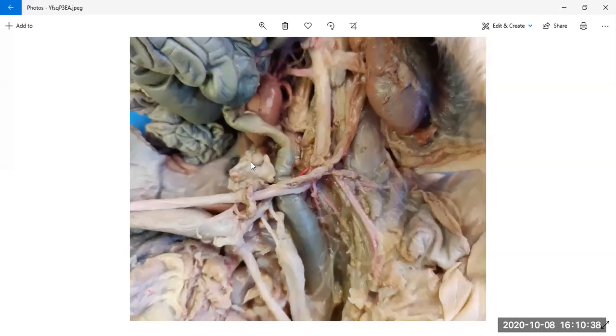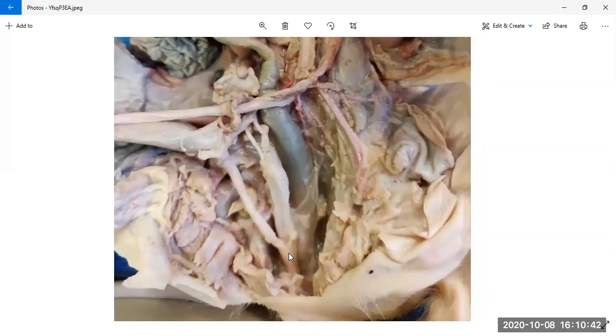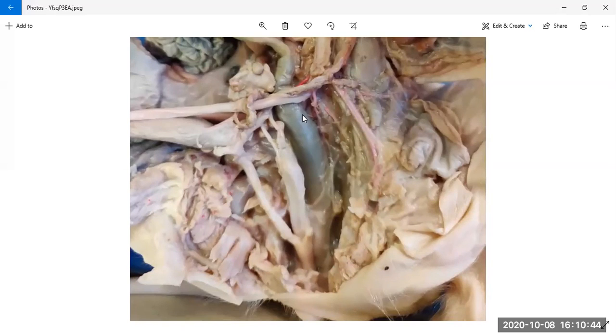So this is going to go to what looks like the penis. Yes, the testes are going to go to the penis. And this one looks like the urethra. At the end, they are going to come together because usually the penis and the urethra have the same opening. So these two are going to go to the same external environment.